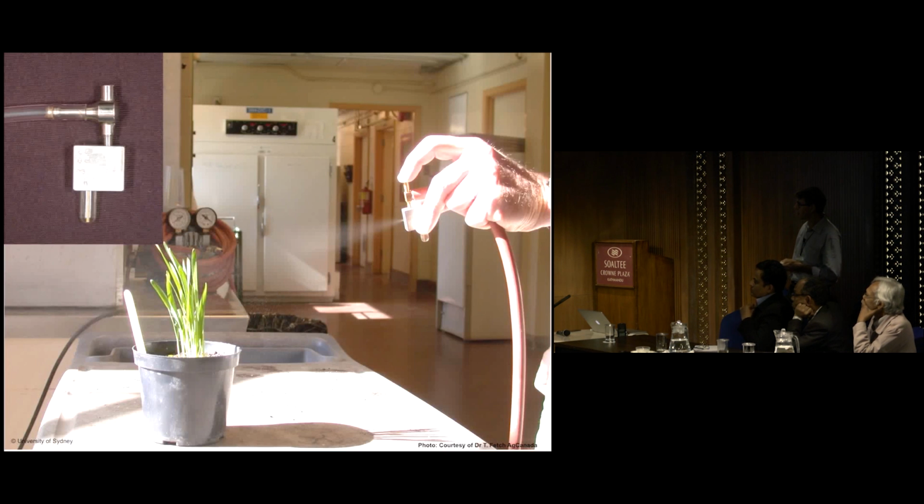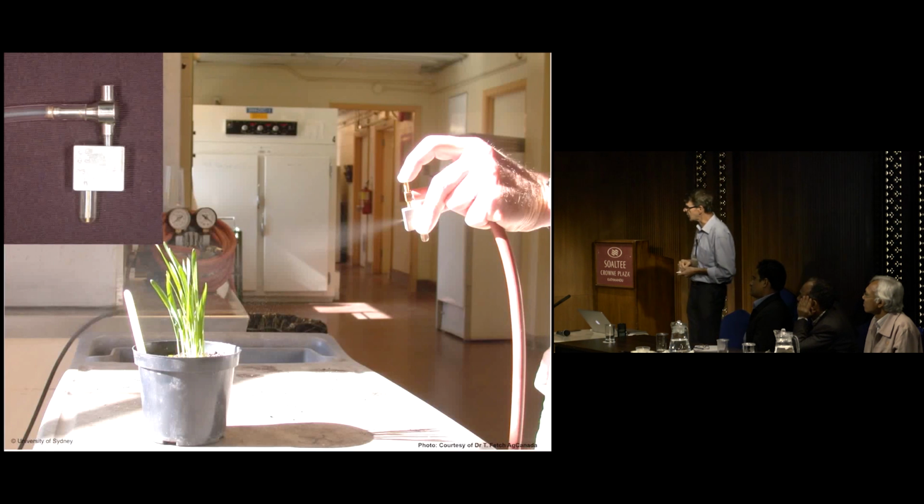It just goes on the bottom, and when the air pressure comes through here, all you need to do is put your finger on the top like that and it blocks it, and the suspension is blown out of here, and you can see that here. Extremely fine mist, does not burn the plants because it's so fine, and you can use very small quantities of rust and inoculate plants using this method. Our method tends to be a little more wasteful. We need more rust, but this is a highly efficient way of inoculating plants.